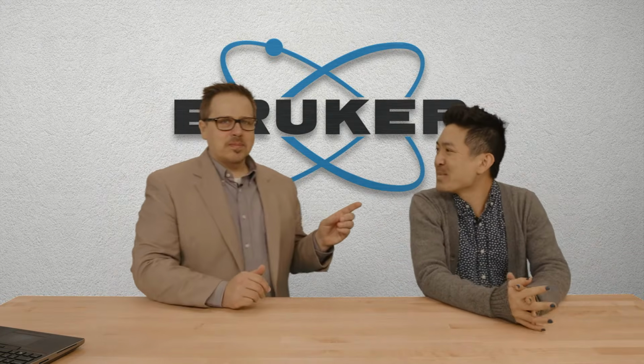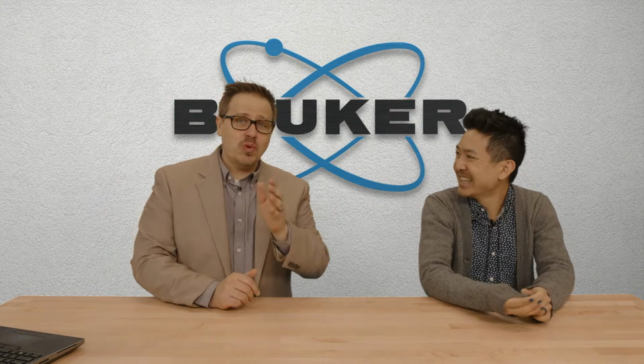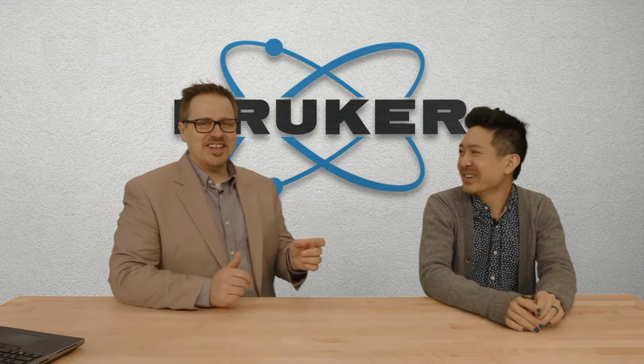Nate, that was like 18 episodes ago, because today's episode actually is our 20th episode, so that's actually really exciting.